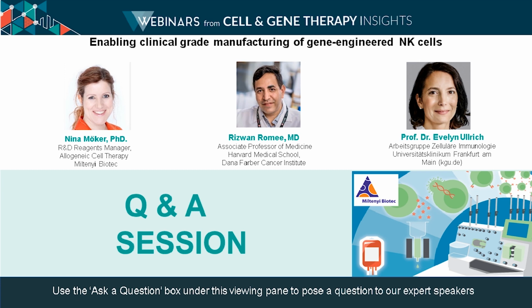Thank you, Rizwan. Evelyn, any advice from Frankfurt? Yeah, these points are well taken. For sure, it's of high importance to get an excellent GMP grade virus production to have the capability then to produce a large amount of CAR NK cells. This will take us to this other aspect that we mentioned in the beginning and has been shown in the webinar by Nina: that new technologies also emphasize non-viral systems that could also be used in the Prodigy closed system combined with electroporation protocols.